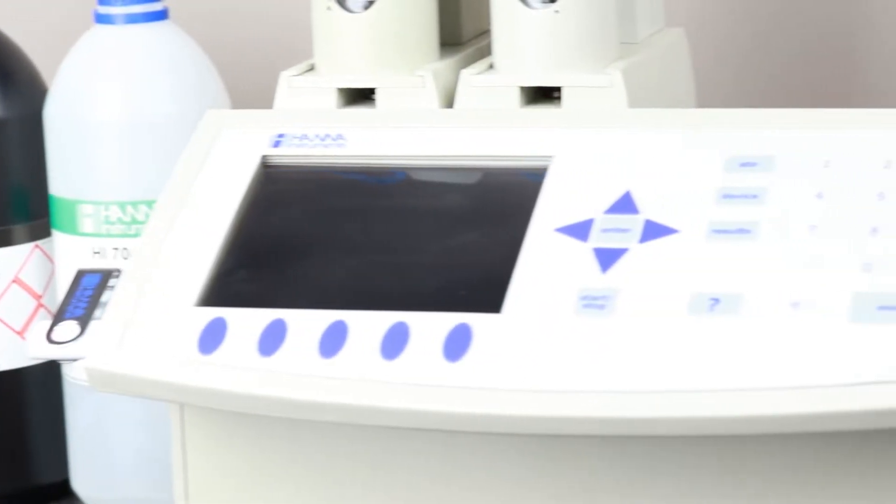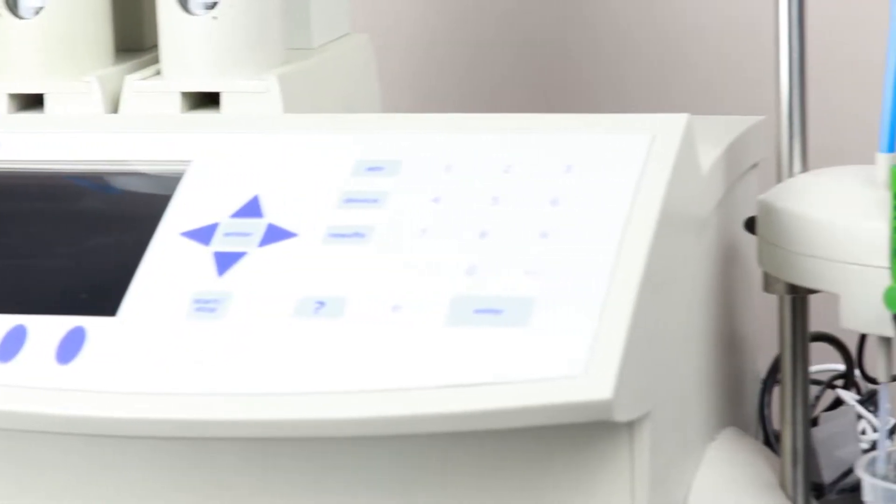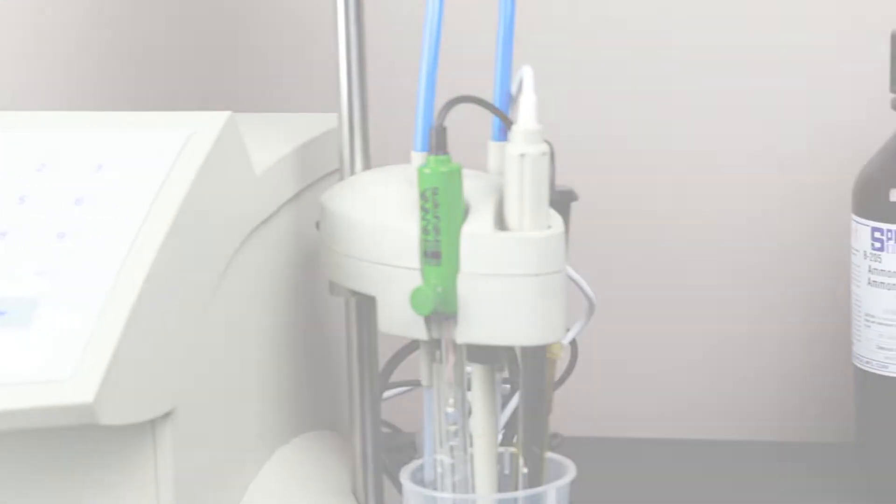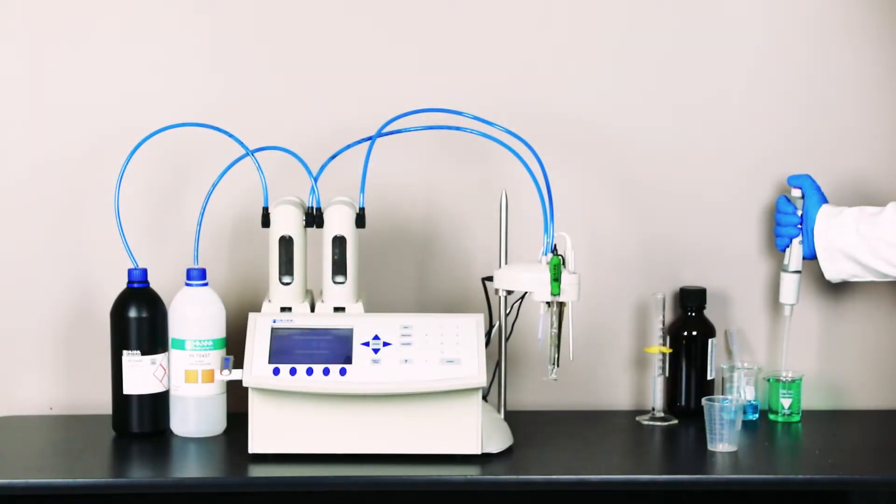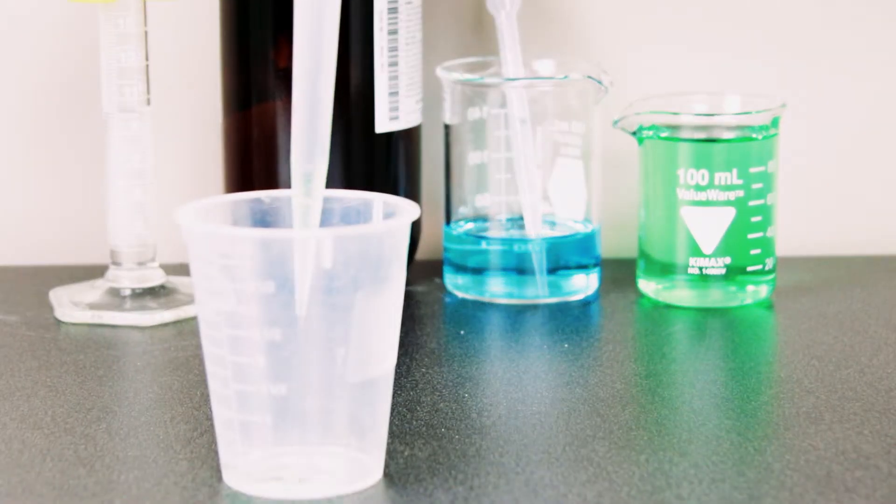We can also perform nickel titrations using the Hanna HI902 titrator. Doing this titration involves a few simple steps. First, add your sample and some distilled water to submerge the electrode.